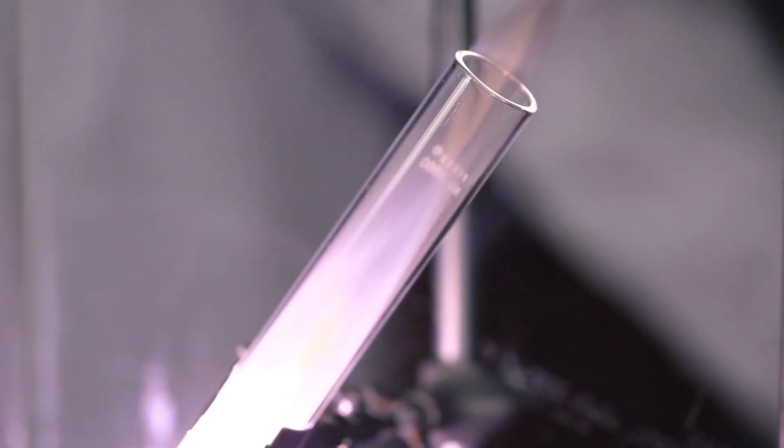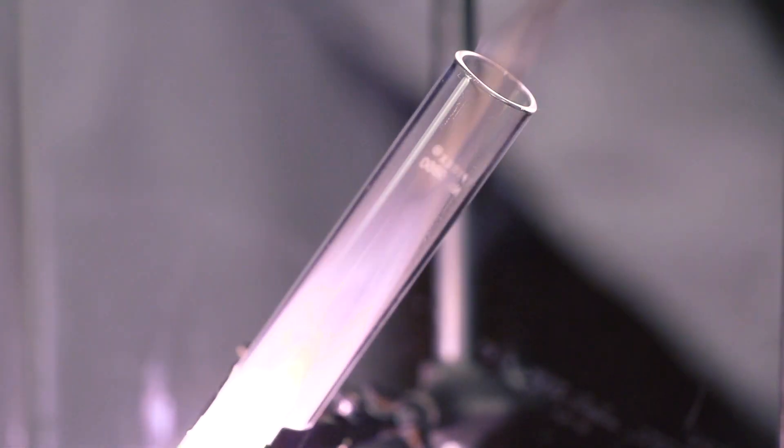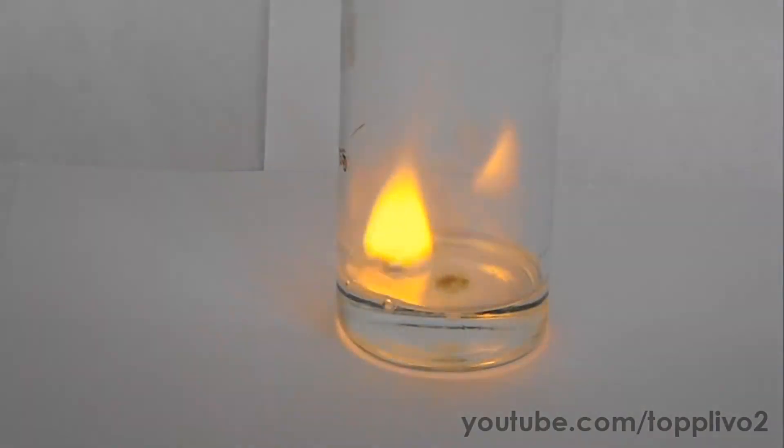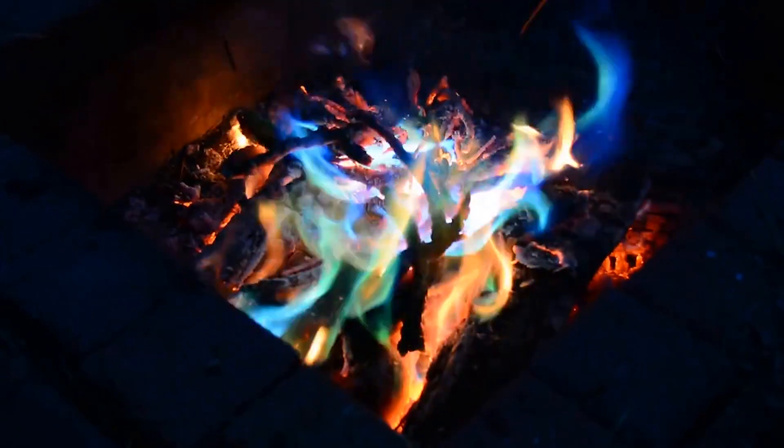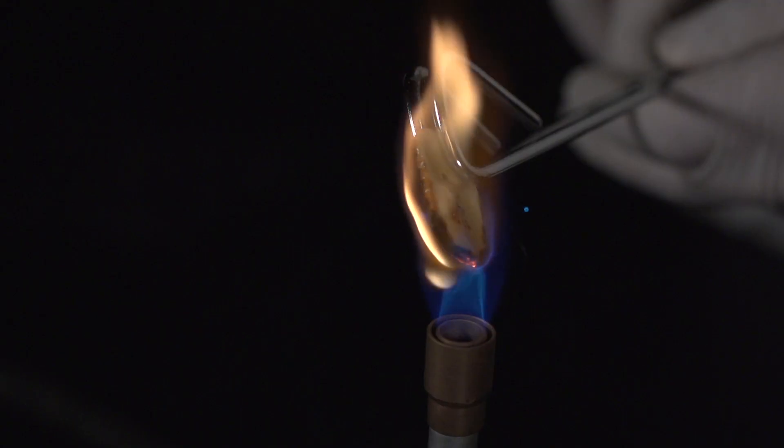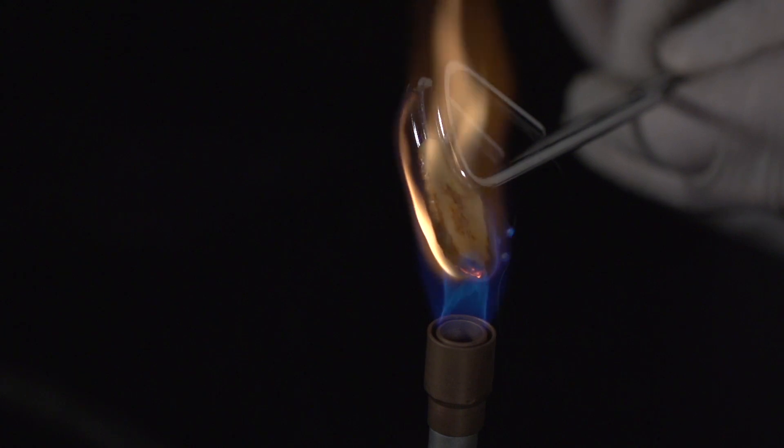Now, about that purple-y, lavender-y flame that came out. What was that? The food dye from the candy? The heat from the experiment? Well, no. When burned, potassium gives off a beautiful lavender color. Sodium burns orange. Magnesium burns white. A lot of elements have their signature color they give off when burned. You may have even seen those pine cones you can buy that change the color of your backyard or campfires. They're coated in various forms of these elements. It's not magic, it's chemistry. There's even a test we'll get to later on on this channel called the potassium flame test, so check back for that later.